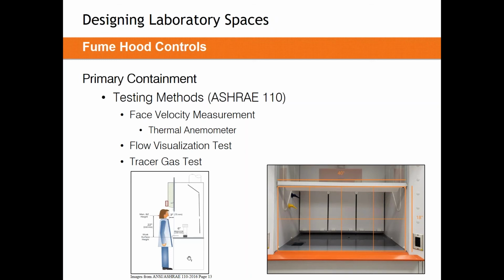What you're looking for here is that the smoke in the air is directly pulled back and up and out of the fume hood. What we want to avoid is lazy airflow, meaning when we release that smoke, does it drift towards the front of the fume hood, towards the sash, before heading out the back? That's what we want to avoid.